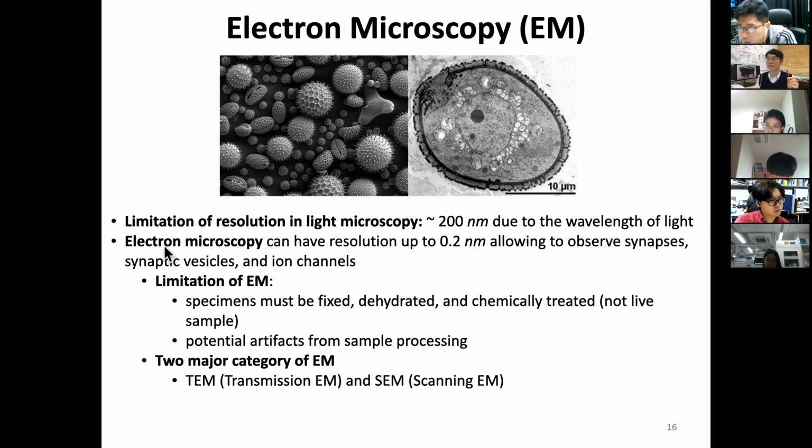So the concept of electron microscope is we have to use a wave. But you know the famous De Broglie in physics, who got the Nobel Prize by proposing that even the particle of electron has a wave phenomenon. We call it matter wave. Electron is a particle, but it's so tiny that it has its own wave.